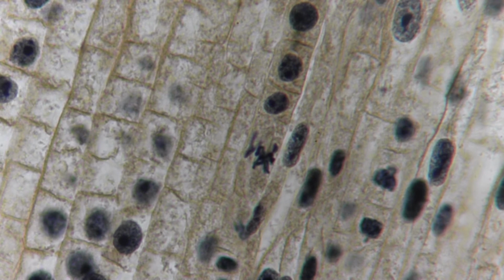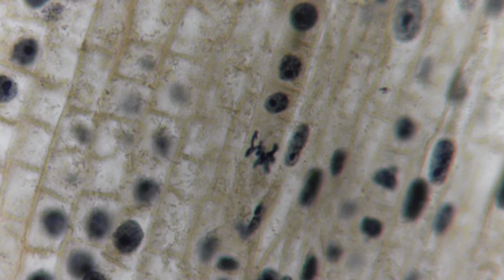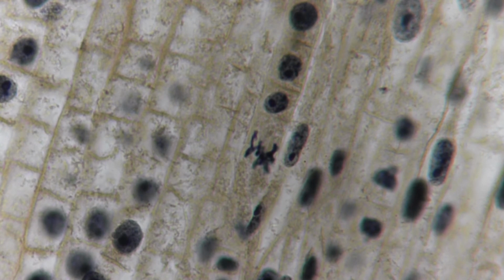Now they have met in the center. They went from being real disorganized until they've lined up horizontally across the cell. Now you're going to have to draw the cell wall in. It's not real distinct, but those chromosomes there are in metaphase because they've met across the center of the cell. If you look at the label it calls for on plant cells, there's a part there that's not visible as well as it is on animal cells.